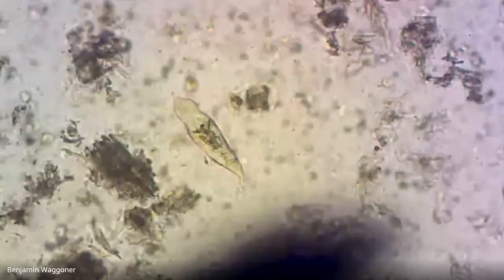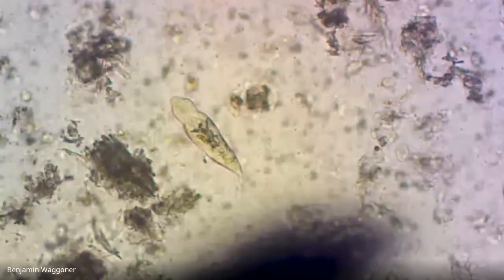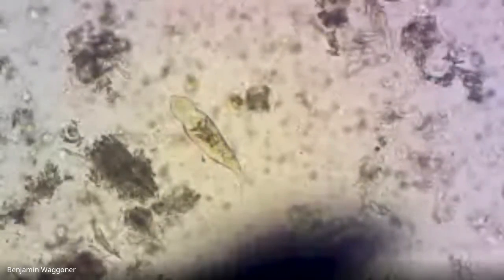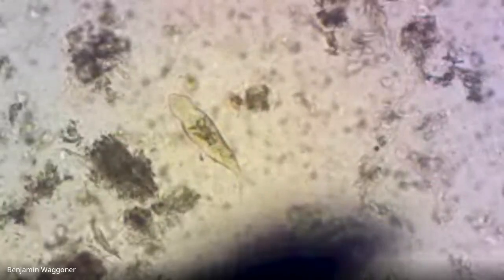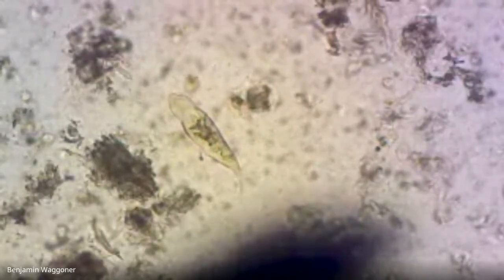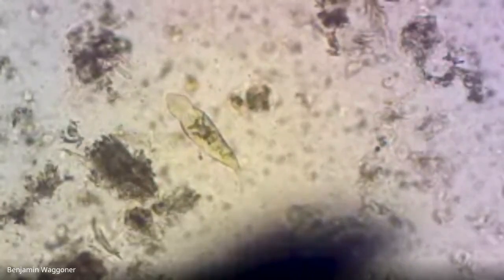So there's a lower magnification of Trichonympha. The Trichonymphas that I've seen before tend to be fatter than this. They tend to be more pear-shaped. I've described them as looking like they shake when they laugh like a bowl full of jelly. They look a little bit like a hippie Santa. This one's a little bit more slender. I don't know if that means it's a different species or what. But, ooh, what are those?